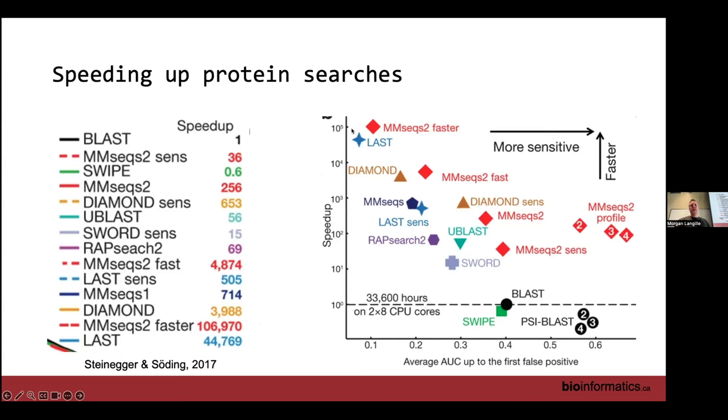The more popular ones nowadays are the next few. One is UNIREF, and I would classify this as probably one of the most comprehensive functional databases. The reason is that they take a systematic approach where they take all the proteins from all reference genomes and routinely cluster them at a particular amino acid identity. They don't care about trying to precisely put things into different ortholog groups or groups of genes. They do that at different amino acid identities. So UNIREF 100 is at 100% identity, so they just collapse them at 100%. UNIREF 90 is at 90%, and UNIREF 50 is at 50%.